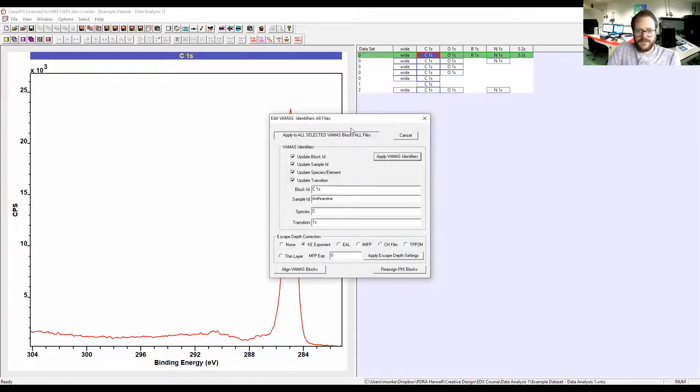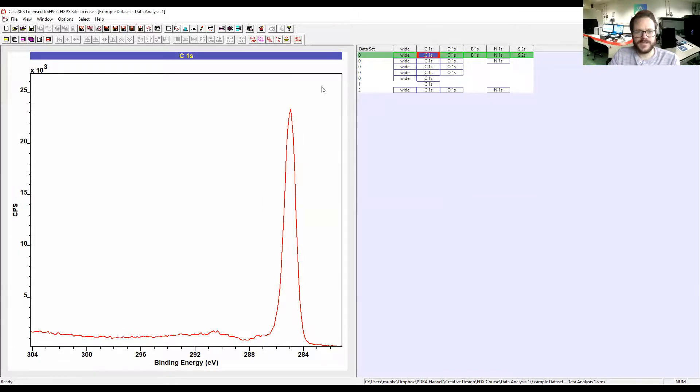Finally, in here we have the VAMAS identifiers. We have things like the Block ID, the sample name, and what the element and the orbital are. The Block ID is our column header up here, obviously the sample name, and then we have the element and transition which will link into how the software opens up the sensitivity factors. It's not the end of the world if these aren't correct, but again I wouldn't recommend changing them because it's good for you to know what element and what orbital was recorded here.